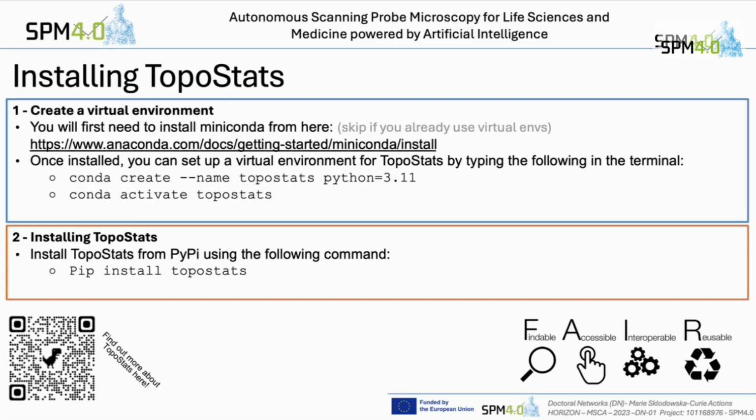Already okay. Is that after the install? Yeah. It's not looking good. Okay, it seems like everything is there. You create also. Yes.